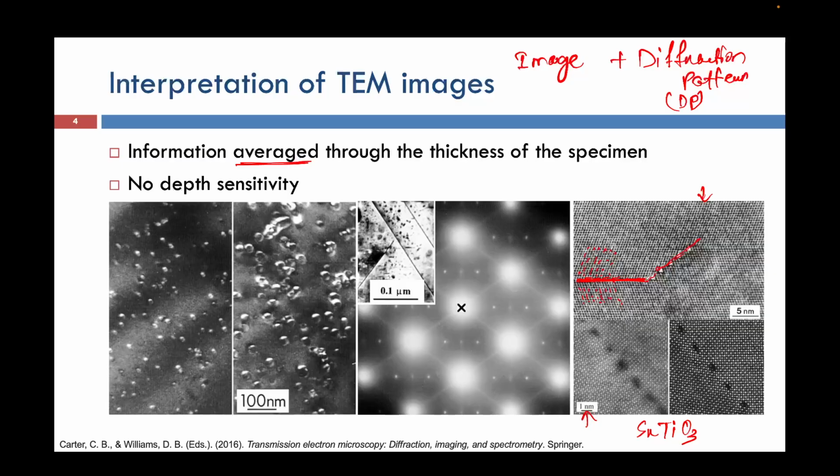So this is one type of image that we get from our TEM instrument. And here you can see the same image, let's say this is image 1 and this is image 2. After using different types of energy filters, the second image is quite comprehensive, while the first image is a little bit blurry.